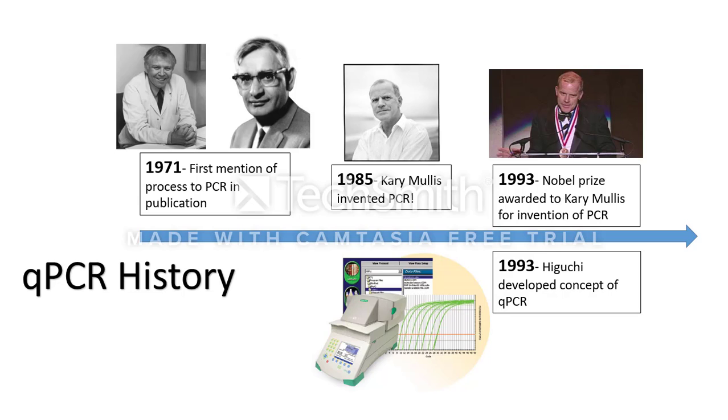In that same year, Higuchi and his colleagues recognized that the process of PCR could be modified by utilizing fluorescence to monitor the progress of the reaction. This would now become known as qPCR.